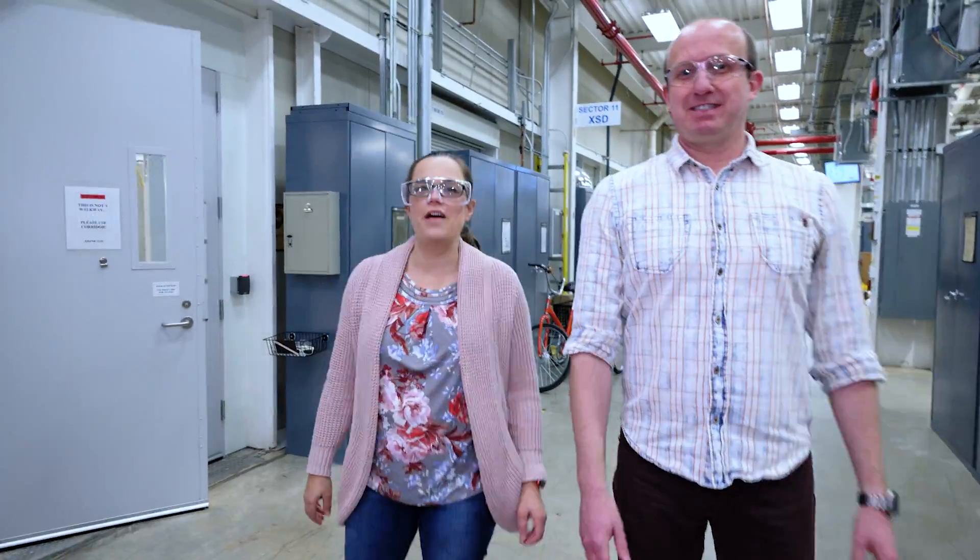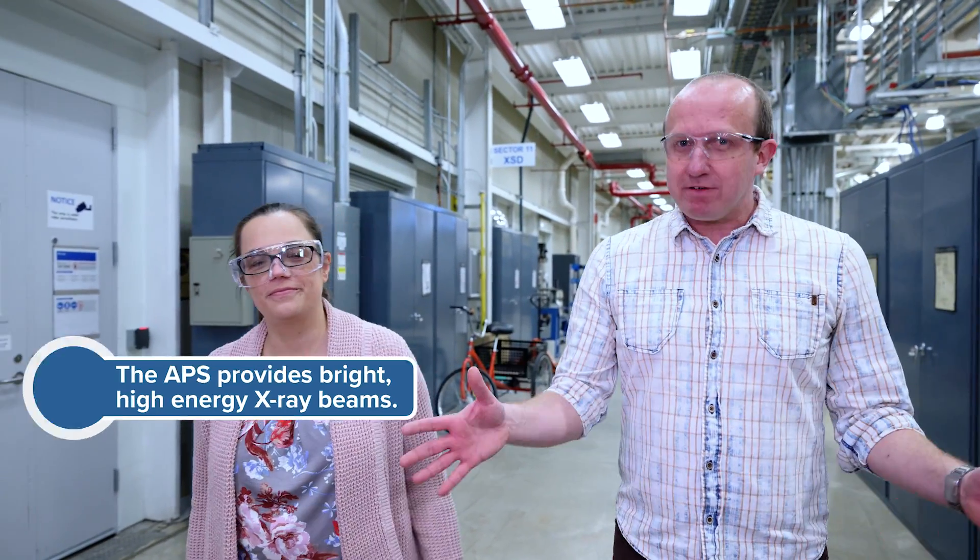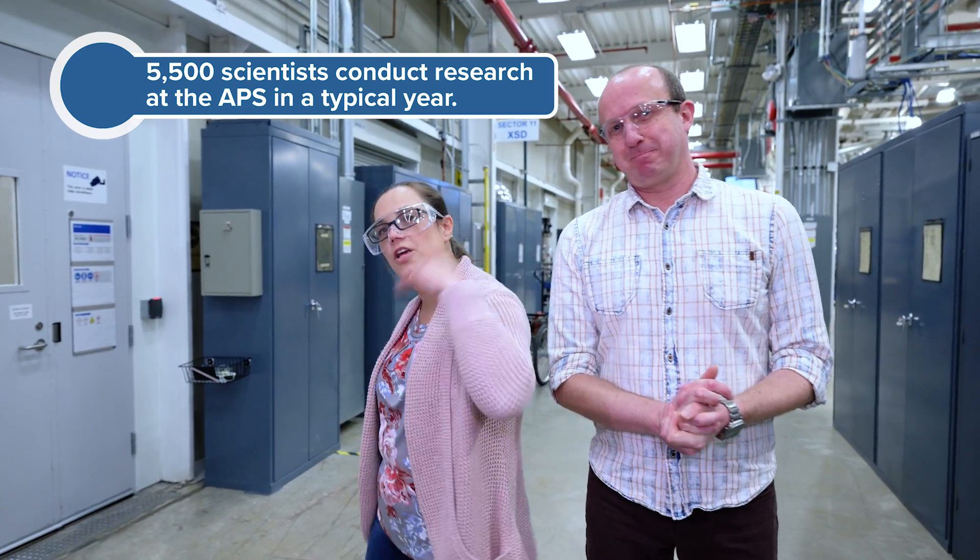Hello everyone. Welcome to Advanced Photon Source. My name is Kasia. My name is Olaf. Welcome to Sector 11, the Structural Science Group, and the electrochemistry lab. Let's go and check out the lab first.